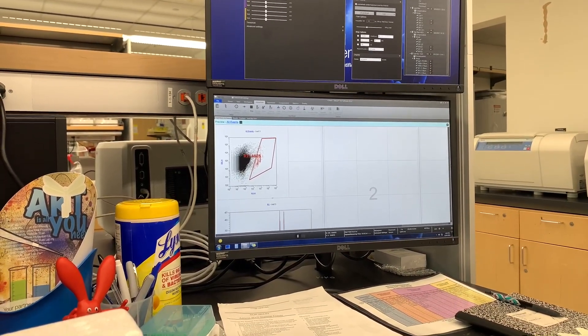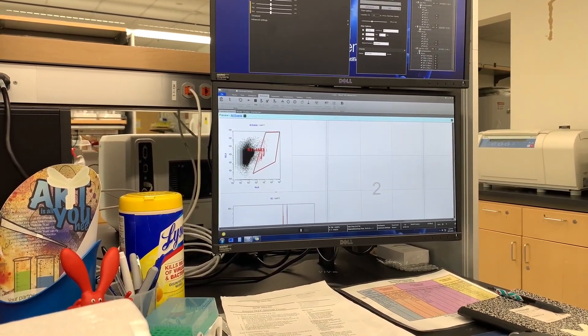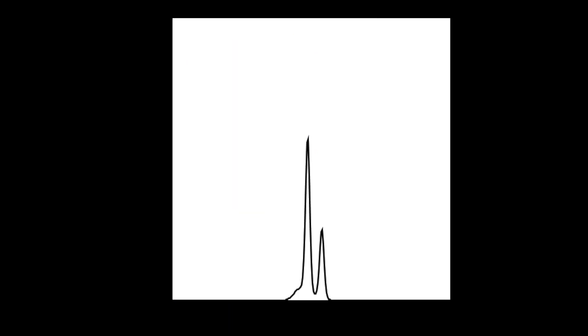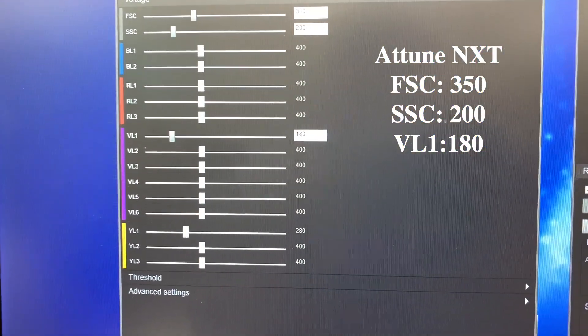This is our reference sample. Our reference sample is diploid, so we should see two distinct populations — the first peak being 2C, the second peak being 4C. These are the voltages I use for the Tune NXT.